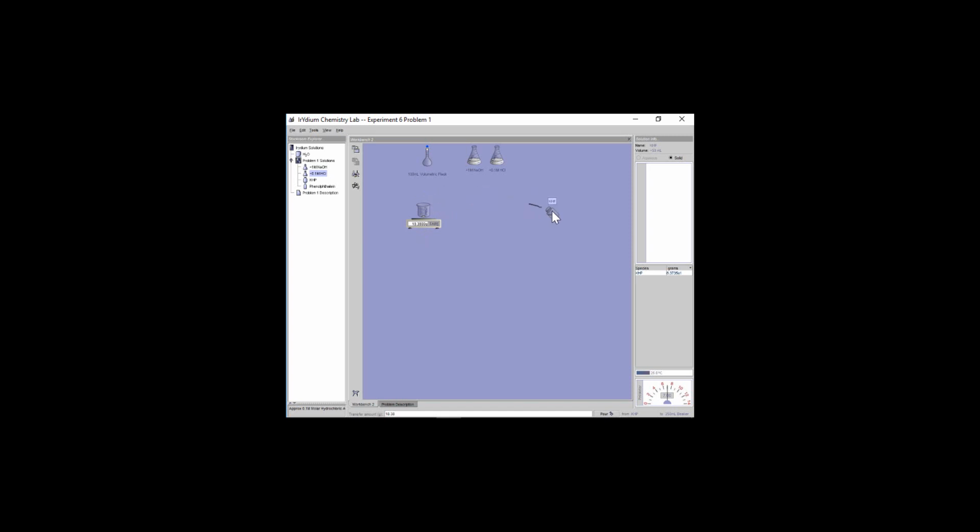Now, I know I'm going to make the standard solution here into a 100 ml flask. I don't necessarily want to just take out my jug of water and just add 100 mils here. Like I said, the beaker's marking of 100 mils is not very precise. The more precise one is actually the volumetric. Why I measure it into the beaker first is I actually want to do the dissolving part. I know in the end it's going to be a total of 100 mils. I'm going to add the water, so drag the water over the beaker. I'm going to pour in something less than 100. So I'm just going to make the dissolving happen. Maybe I'm going to transfer in 30 mils at a time. So 30 mils of water, I'm going to pour that in.